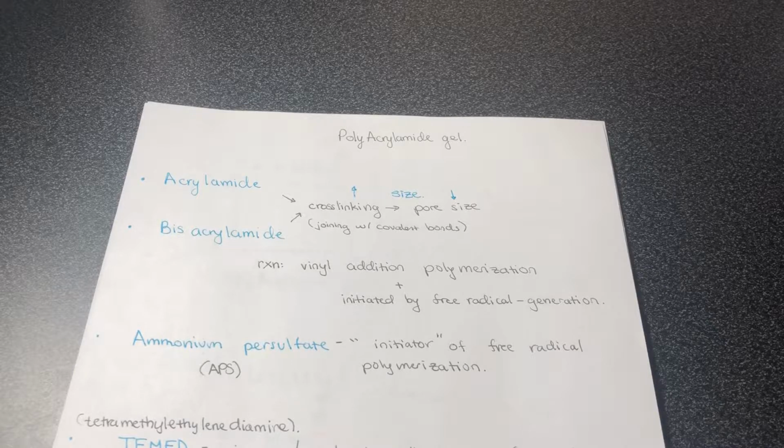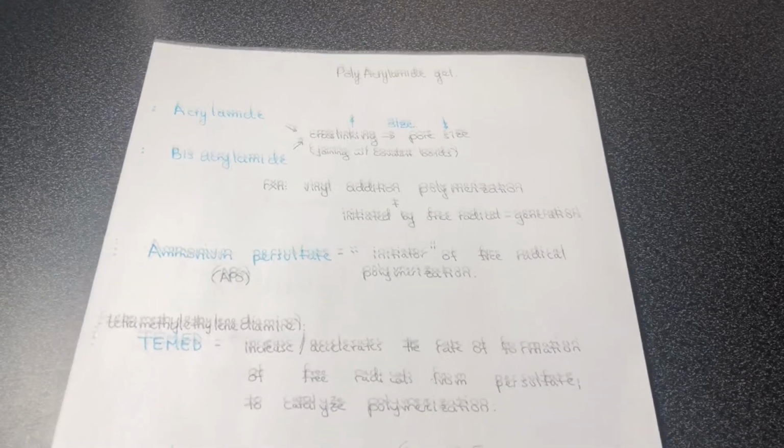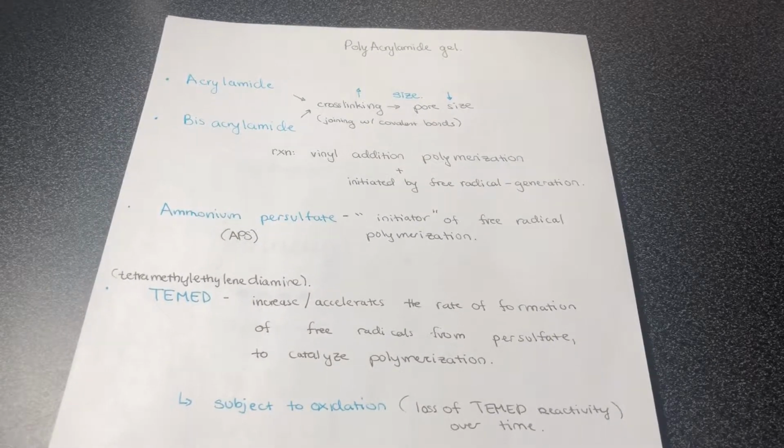So you're sitting there, you put it in, and it takes a while, and you're wondering why it takes a while. So we use TEMED, and you usually add this last. TEMED, tetramethylethylenediamine, which accelerates the rate of formation of free radicals from the APS to catalyze the polymerization. So if you increase the amount of TEMED, it's going to increase the rate.